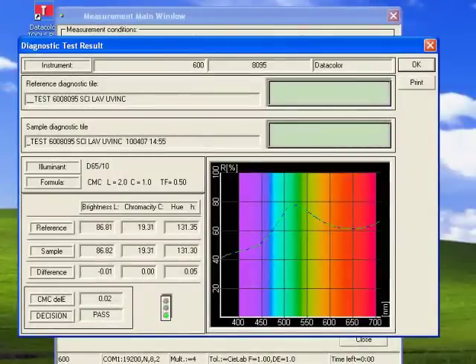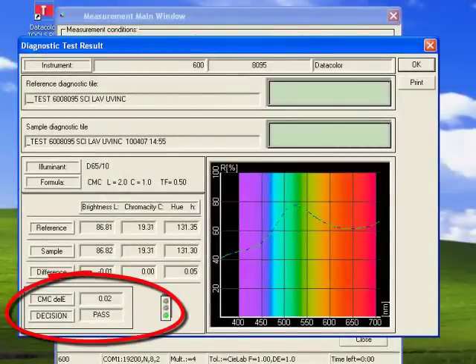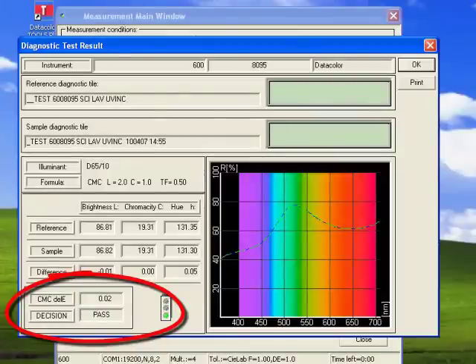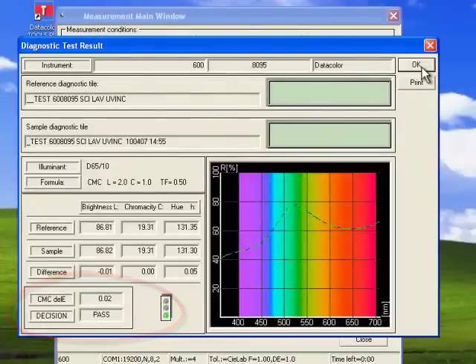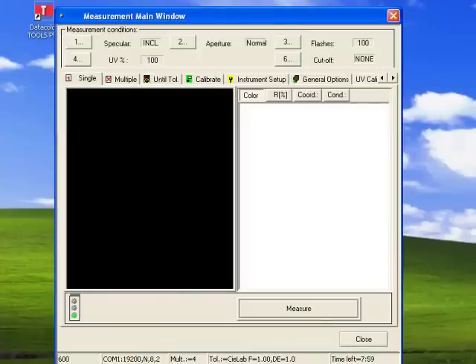When the measurement is complete, the results of the diagnostic tile will be displayed. The decision should be Pass. Click OK to close the screen.